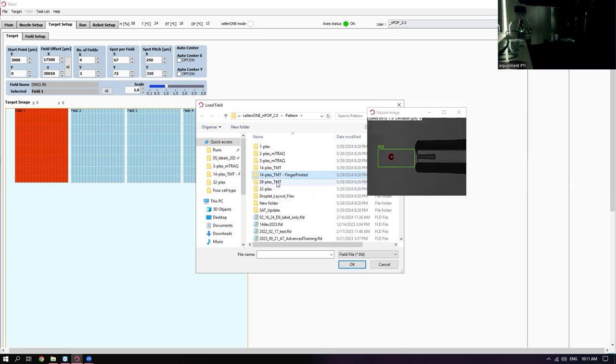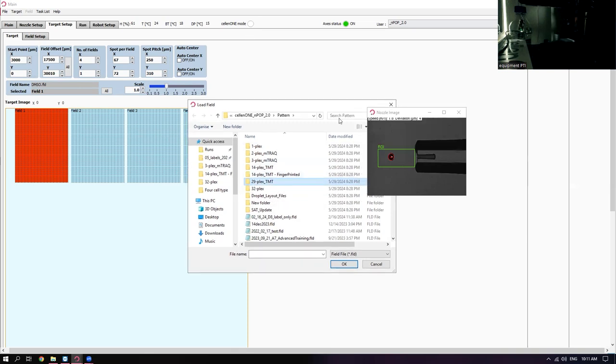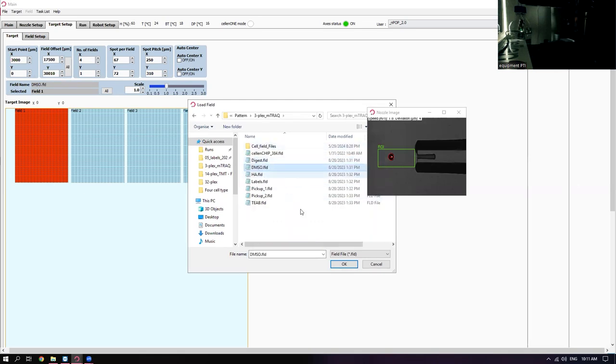And we were lucky enough to get early access to a new version of the TMT labels where there are more than just the current TMT Pro. And I think any of you going to ASMS will learn more about this next week. So we're going to start off with this three-plex M-track run, and we'll just select our DMSO fields.